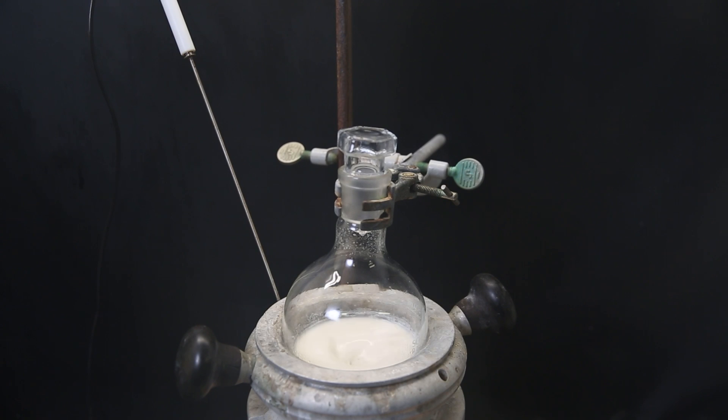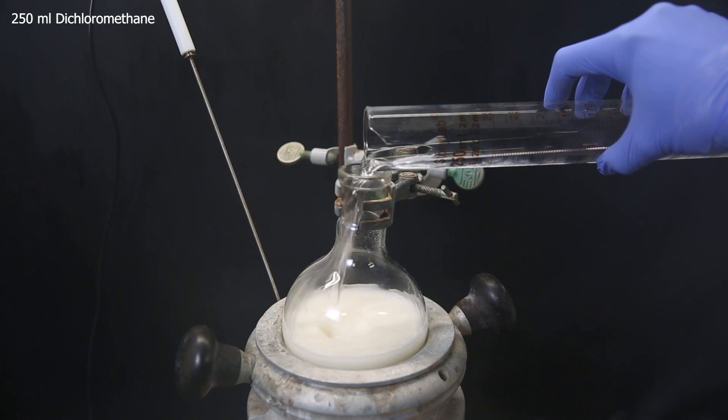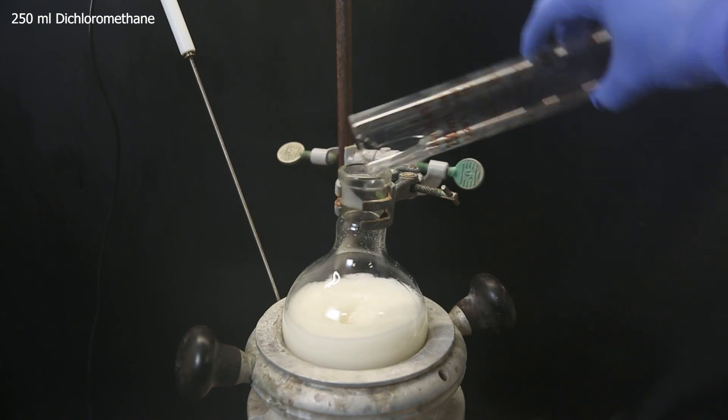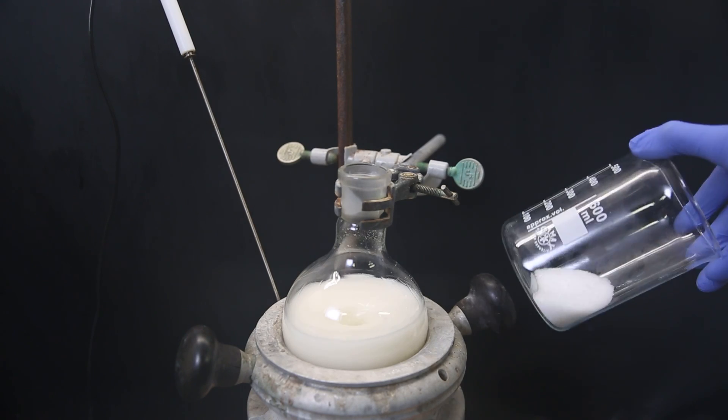When I come back, it seems some stuff has precipitated. I dilute this mixture with 250 ml of the solvent dichloromethane. I then weigh out a small excess of sodium hydroxide compared to the acetic acid I added before and dissolve it in some water.